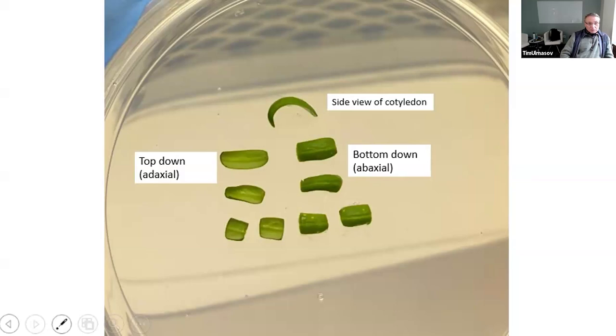That's another good point. Overgrowth is obviously something to always watch out for. And on that topic, there are now new strains, right? Specifically designed auxotrophic strains. We don't have them here, but I'm thinking about bringing them in, and I was wondering about your or other people's experiences. There is a methionine and a thymidine auxotroph, and people have different opinions about which one is best. Do you have any experience with that?